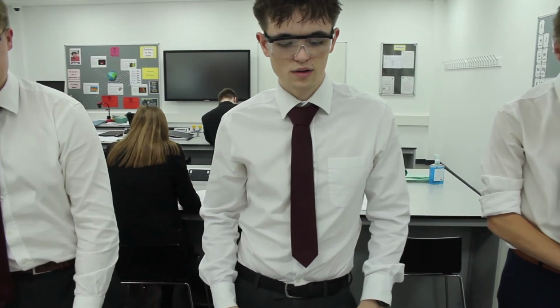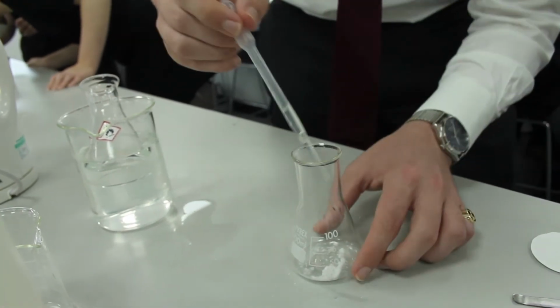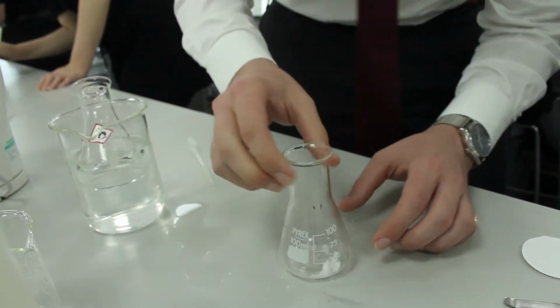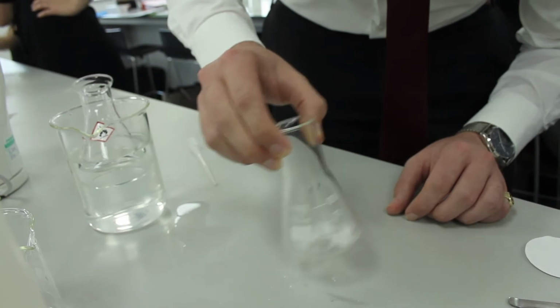For this part of the experiment, we're doing recrystallization, which involves us taking our impure aspirin crystals and dissolving them in a hot solvent, and then filtering them through, cooling them down, and it should reform just the pure aspirin.